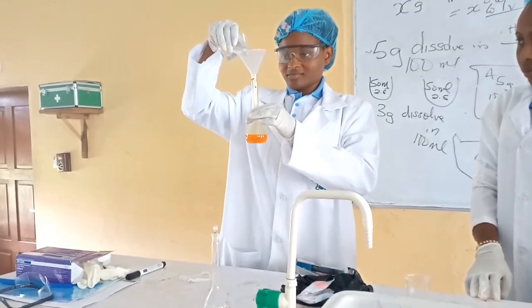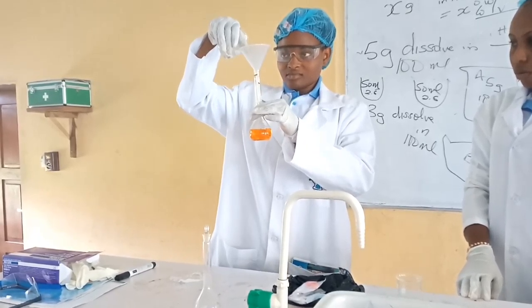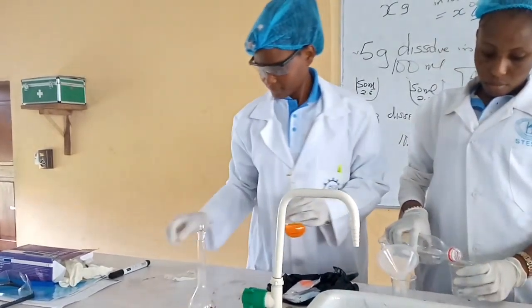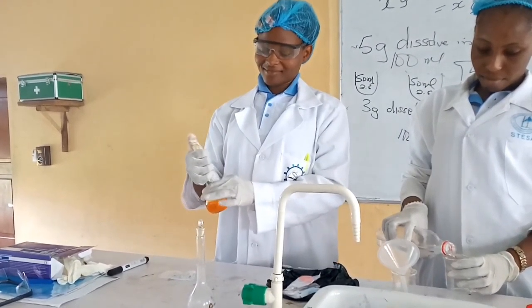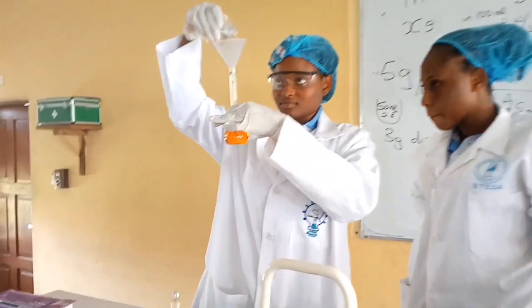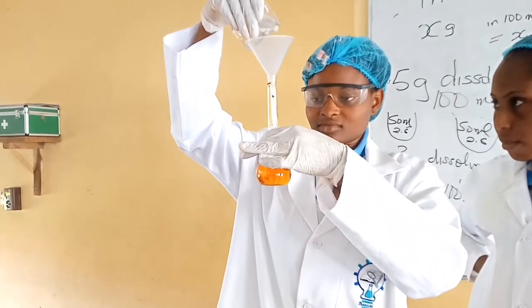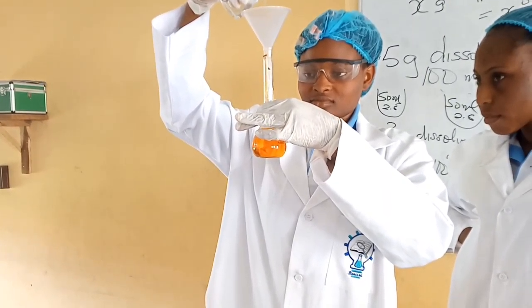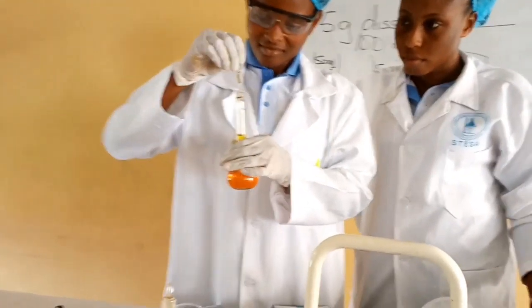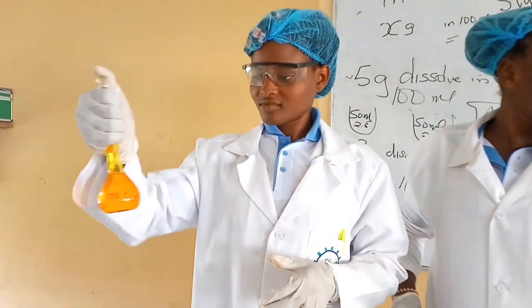If she's done okay, that the thing has dissolved, our next and final step is to now bring the water to that mark. And bringing the water to that mark, people used to have problems. Some will keep the funnel there and be pouring. Are you with me? And she's putting it at eye level. Some of us, you're putting it on the table and you're pouring like that. Don't be lazy in the lab. You have to be intentional. And you don't overshoot it. Once you are a lab person, it doesn't happen. It only happens to beginners, people who are amateurs. Are you getting me?